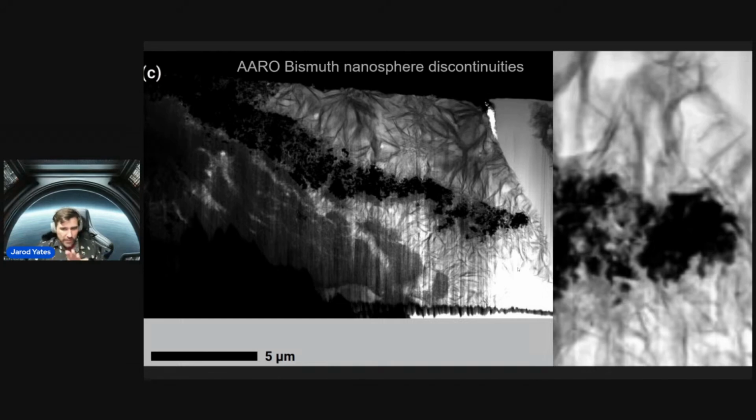And yeah, I'll totally give them credit for that. If I was building a waveguide, if I had to use a waveguide and it had this kind of structure to it, I'd just be shaking my head. It would be so unpleasant to try to use that as a waveguide. Here's a more zoomed in area of here. Now, the sizes of these things, you can see these little nanospheres of bismuth that are scattered throughout the bismuth layer, that are comprising the bismuth layer. That's really interesting. That's really telling of a couple of things. Maybe how it was built, maybe what it was being used for.